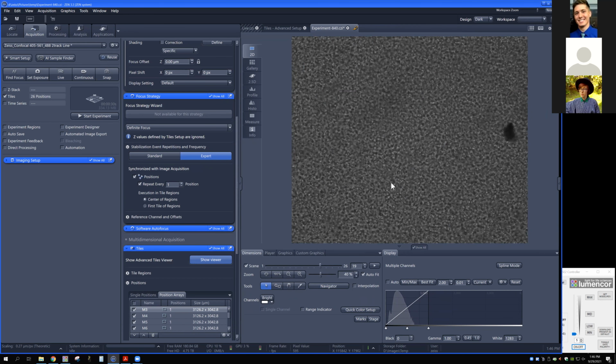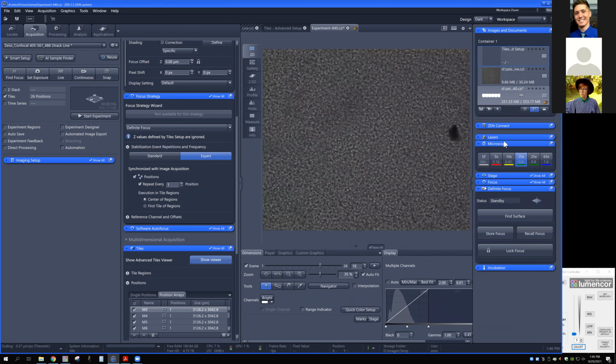Look, all right. That's exactly how we would do it. So for anything that you're doing with definite focus, that's exactly how we'll do. I guess since we have 15 minutes too, maybe I will show you also the other definite focus, which is over here, which we haven't really talked about much either.